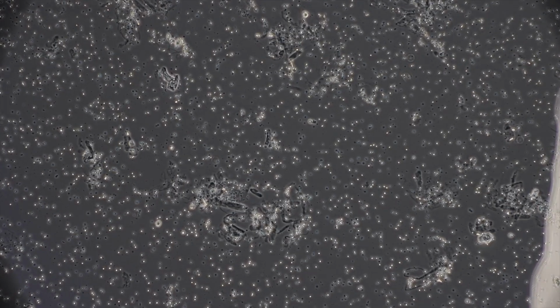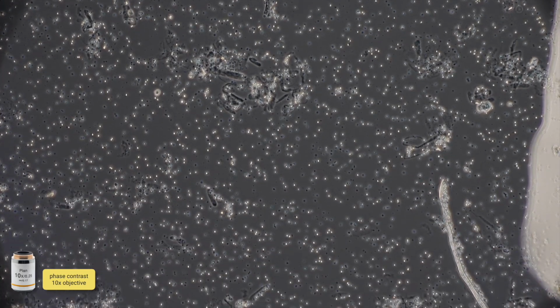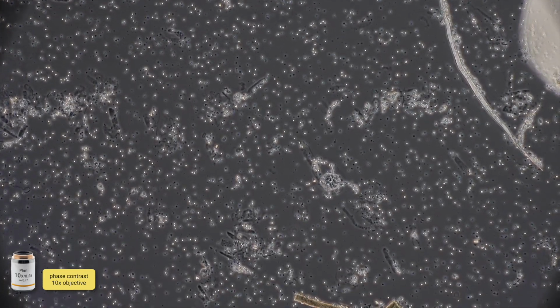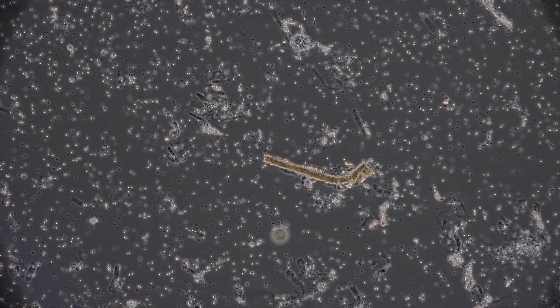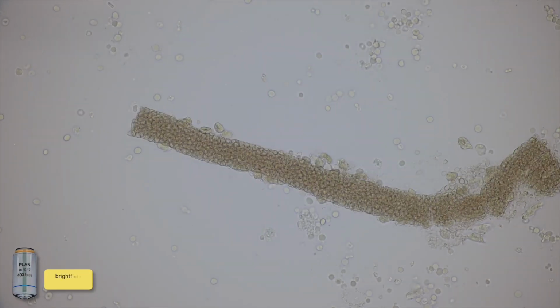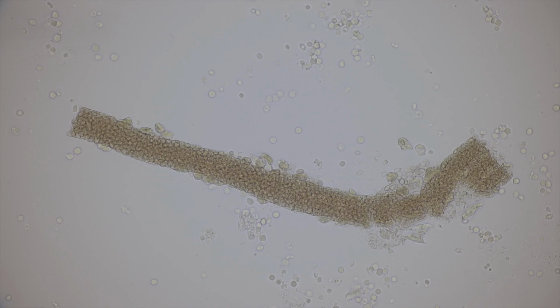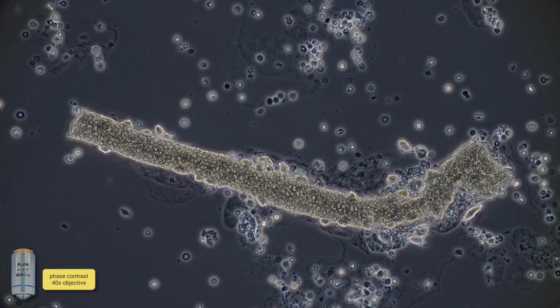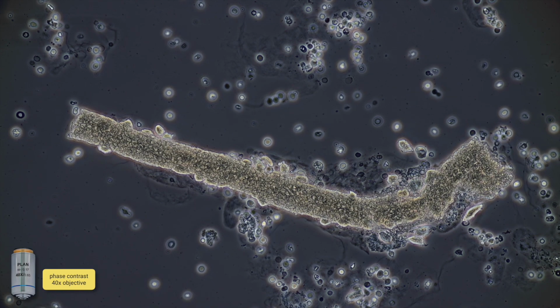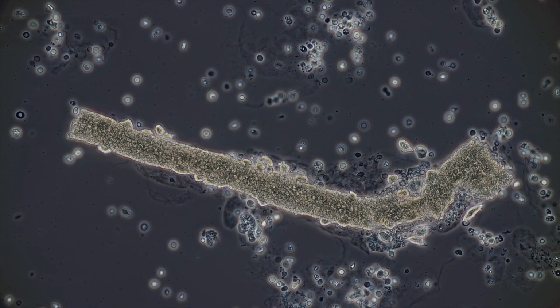Here we'll switch back to an unstained slide under phase contrast with the 10x objective, scanning around. We come upon a pigmented cast. We can't quite tell whether it's a granular cast or a cellular cast. On the 40x objective under bright field, here we can see that this is cellular. We can make out the outline of what appear to be red blood cells. Under phase contrast here, we were better able to see the outline of the red blood cells both within the cast and also see some acanthocytes in the background.